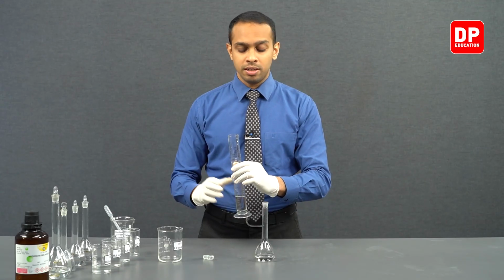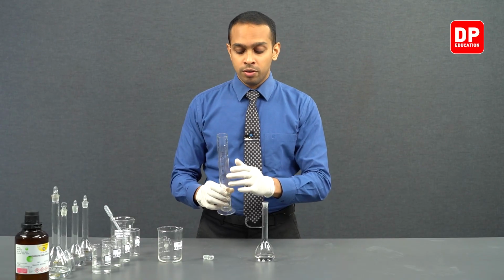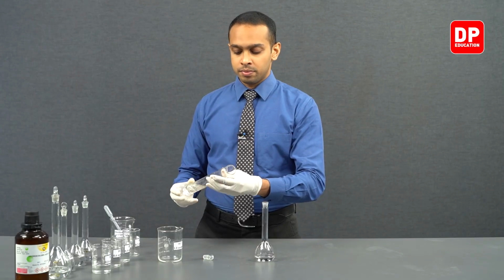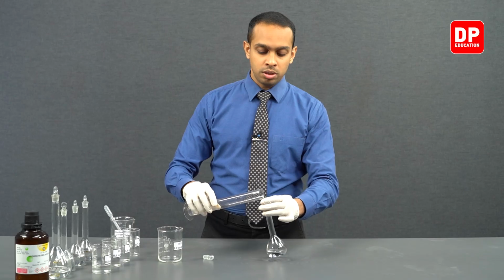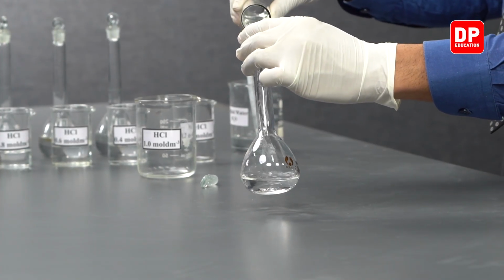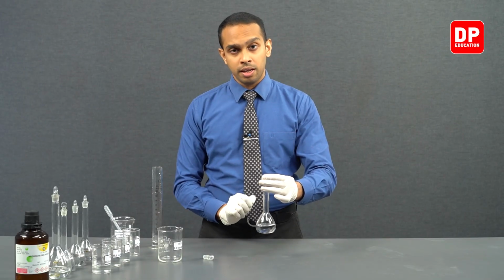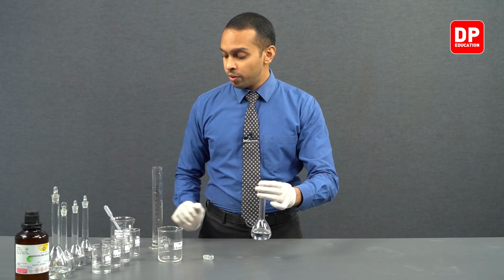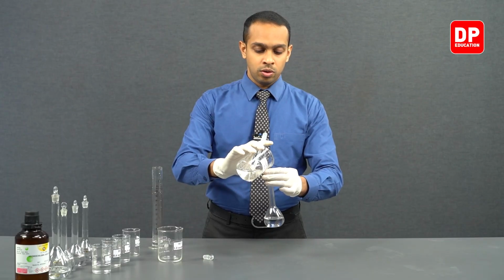After using the measuring cylinder, as we did in the previous experiments, we have now taken a small amount of water. We are going to wash this measuring cylinder, and we are going to introduce the water that is in the measuring cylinder now to our volumetric flask. After taking all of the HCl that was in the measuring cylinder inside our volumetric flask, we can proceed to add more water with the help of a beaker.